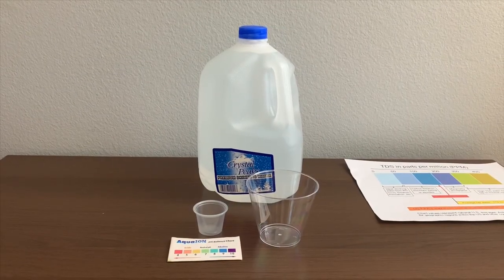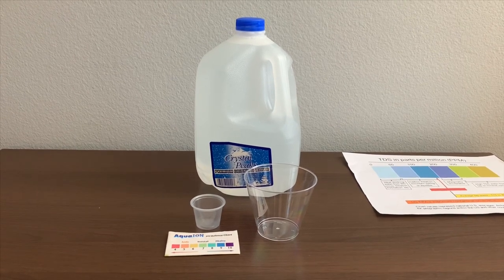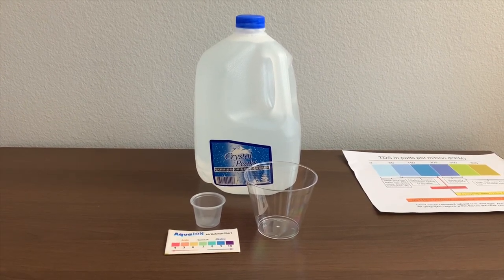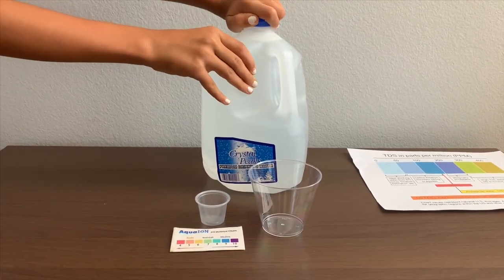This is Crystal Peak premium drinking water, purified by reverse osmosis and ozonation. It costs $1.99 and it is from Nevada. Let's test the TDS and pH levels.